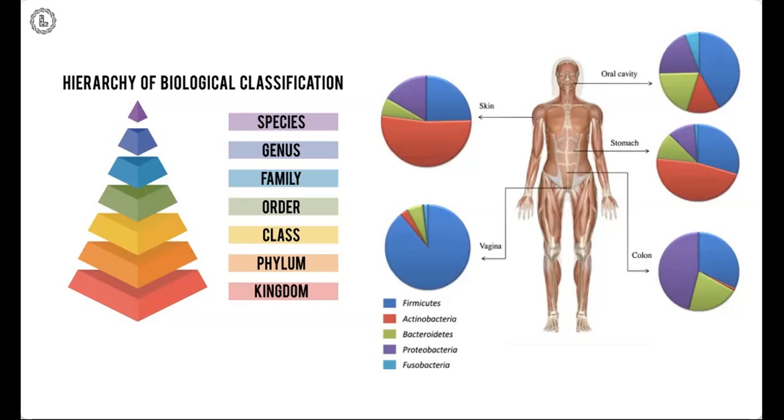Several of these bacteria are still uncharacterized at their genus and species level, so we will know only about the family for these bacteria. The choice of the taxonomic level to understand their proportions will be different for different data sets. For this specific data set, which characterizes the abundance levels of bacterial species from different parts of the body, it is more informative when we consider the phyla level.